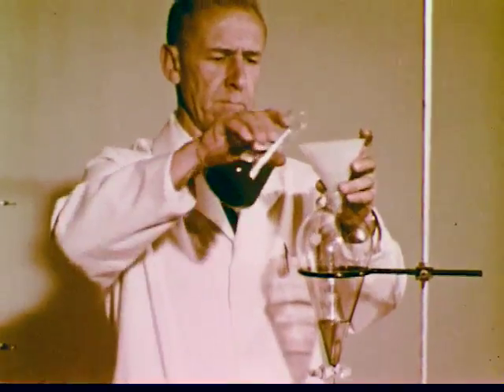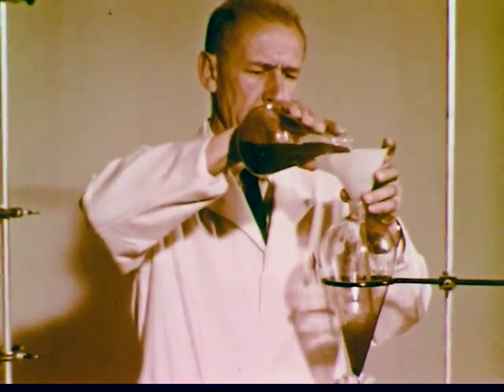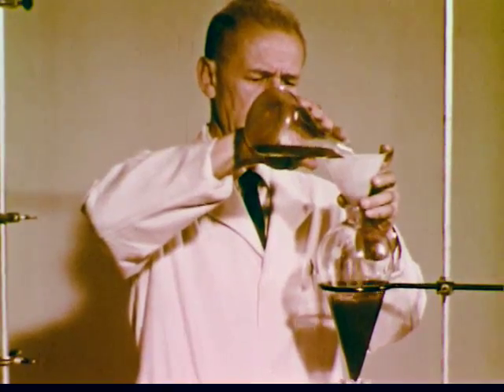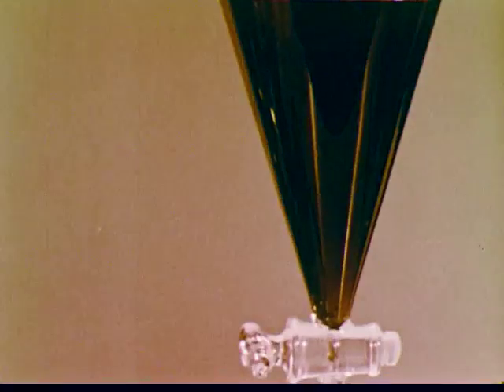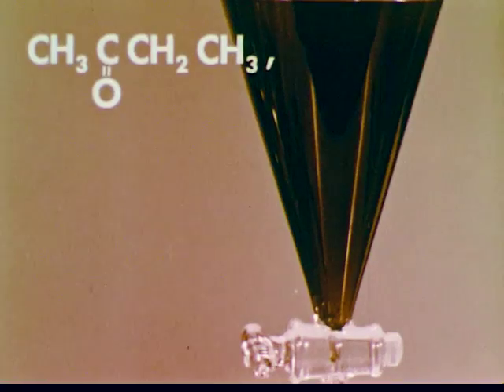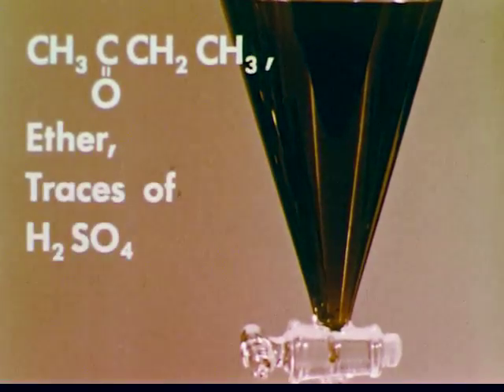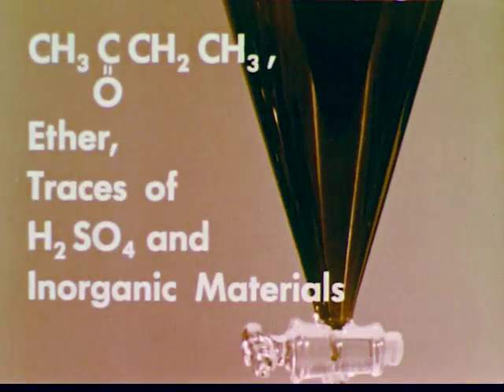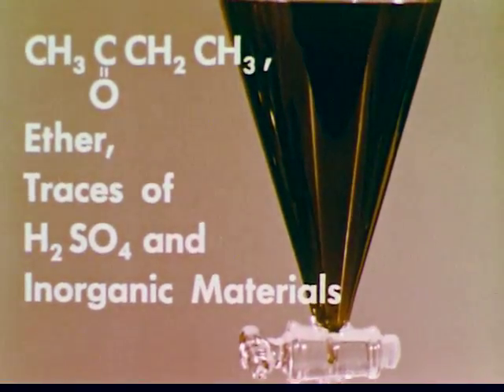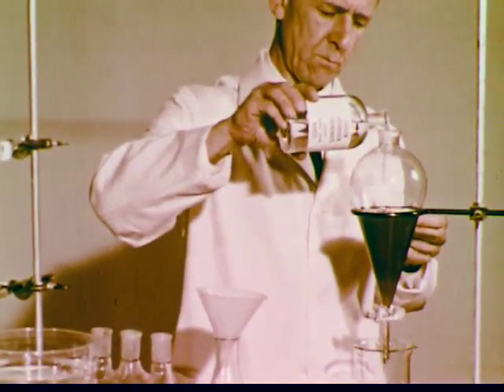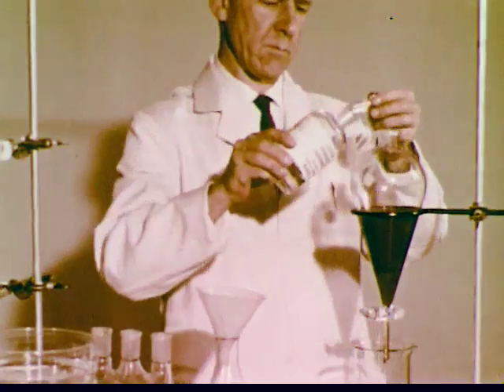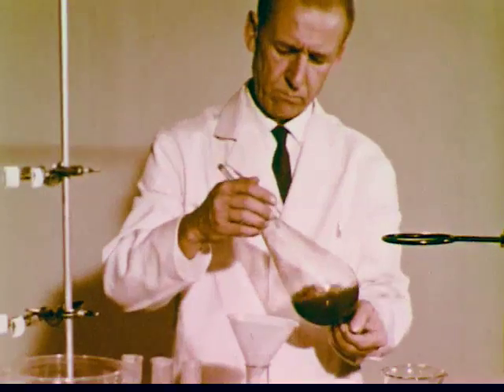All of the ether extracts are now returned to the funnel. The ketone obtained in the synthesis is in this ether solution, which also contains ether, traces of sulfuric acid, and some of the inorganic materials used in the synthesis. Addition of an aqueous solution of sodium hydrogen carbonate neutralizes the sulfuric acid. The reaction of the bicarbonate with sulfuric acid results in the formation of carbon dioxide, and the pressure of this gas is relieved during the washing operation.